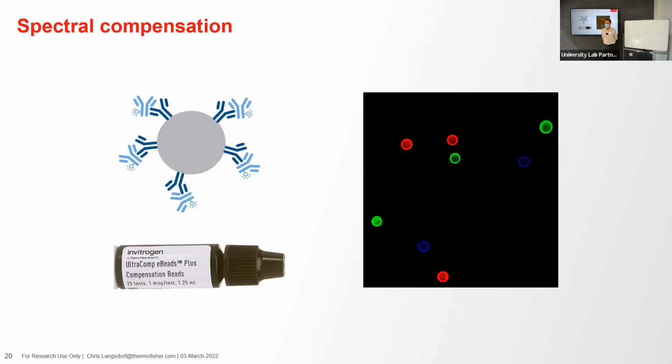I would say that there's a difference between the plus and the polymer. They tweaked it so that the polymer dyes, when they come to the environment, you don't have the artifacts. Yeah, thanks. It gets rid of some of those artifacts that the new polymer dyes have introduced. So as instruments evolve, the dyes evolve, and these have to evolve also to keep up with things.